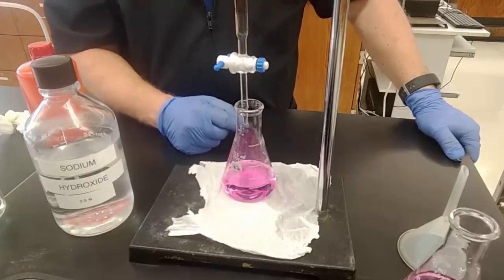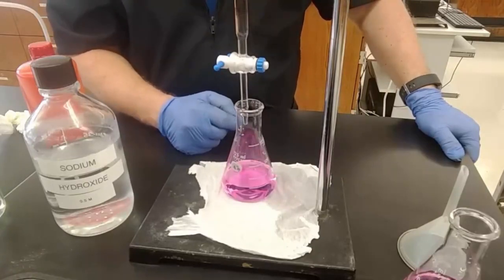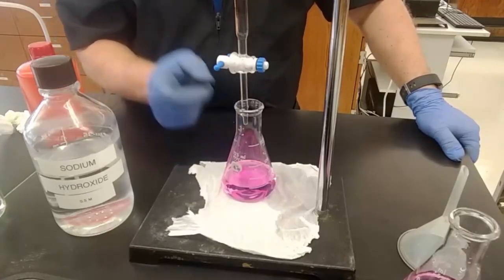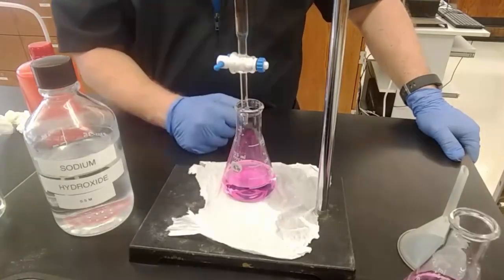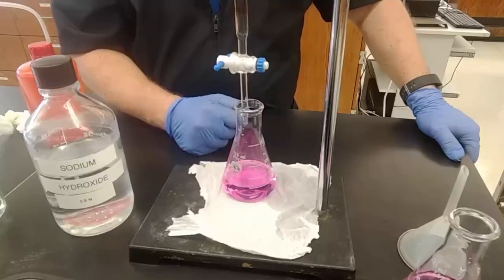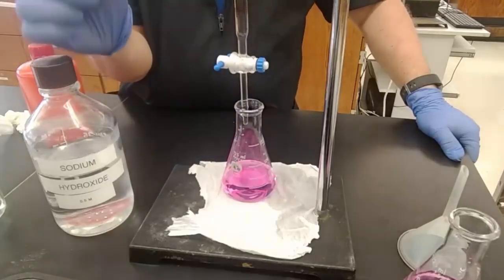Now, if you got a lower percentage of acid in the vinegar than would be expected, lower than 5%, you have to do a little bit of thinking about that. Right? What could require you to add less base? I don't know about that. That's going to be a tough one. Because then we start to get into errors with this bottle.